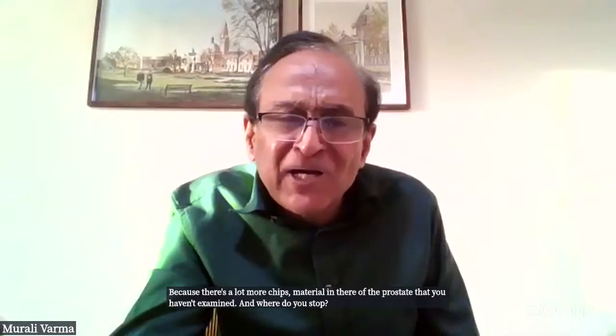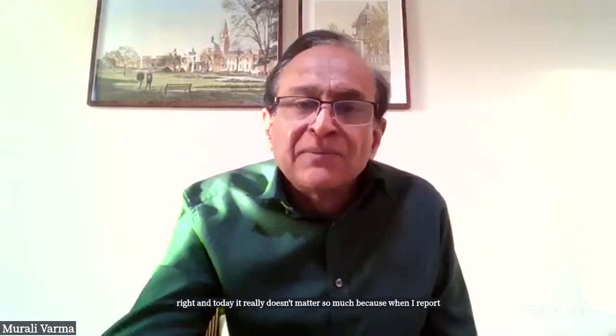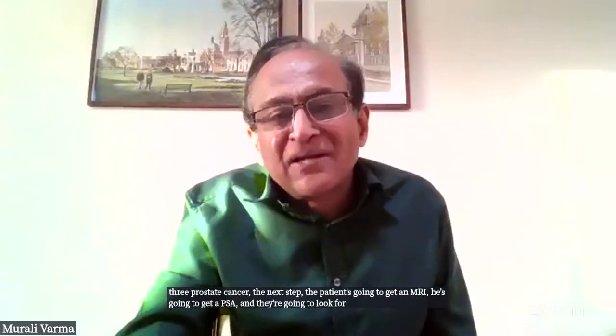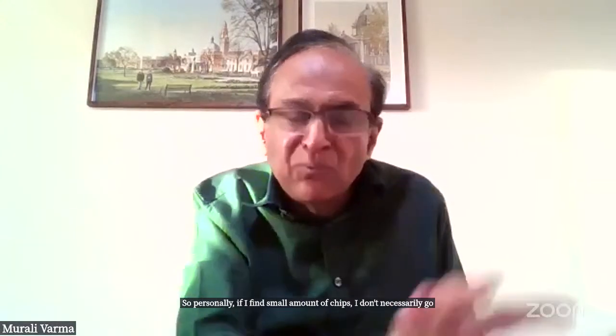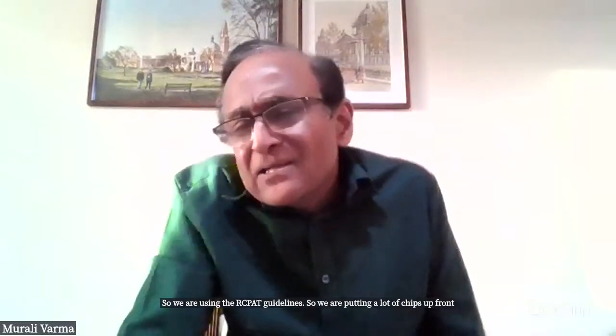Right. And today it really doesn't matter so much because when I report 3 + 3 prostate cancer, the next step, the patient's going to get an MRI, he's going to get a PSA, and they're going to look for clinically significant prostate cancer. So personally, if I find a small amount in the chips, I don't necessarily go back and put more. We are using the RCPath guidelines. So we are putting a lot of chips up front, but it's my personal opinion. I told you this is my opinion.